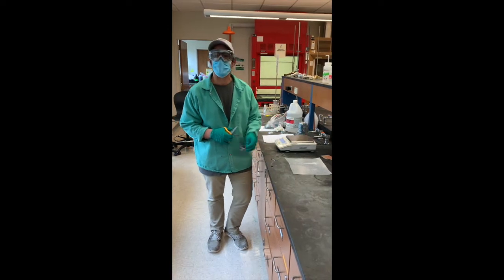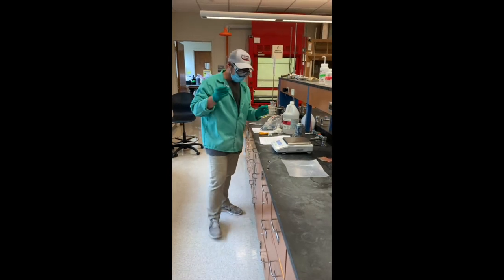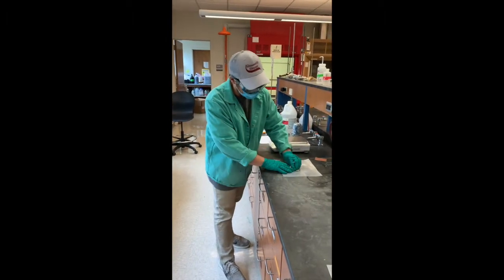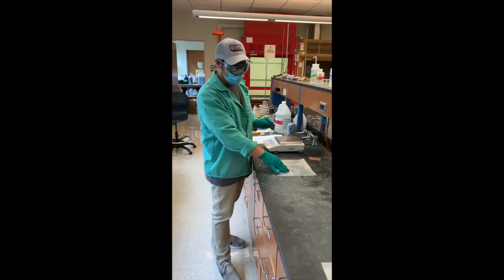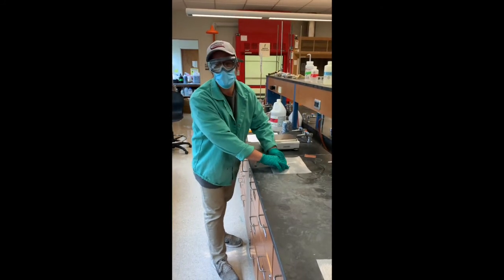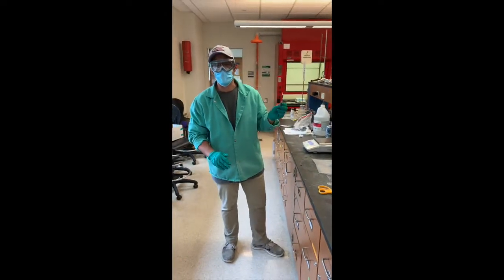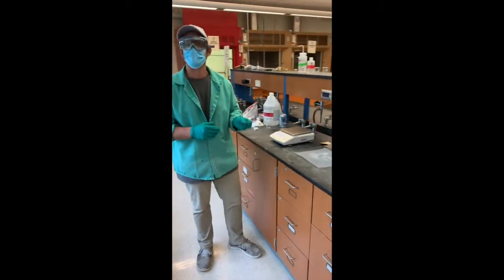Once you have that, we're going to move on to the first step, which is sanding our aluminum. You're simply going to get a piece of sandpaper and your aluminum, and sand off the outer coating and the inner coating, which is on our aluminum pieces. Once you've sanded your piece of aluminum, we're going to weigh it out, just checking to make sure that it's about 0.3.